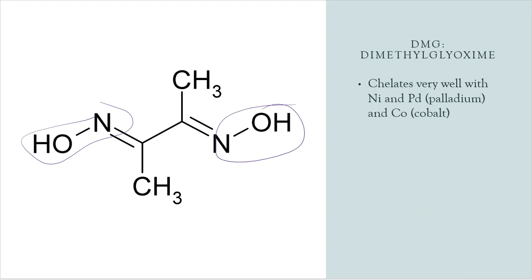The issue here, though, it's not a one-to-one. We've seen this quite a bit in the laboratory. You might not have realized it, but it's been a one-to-one pretty much, except for here. It actually takes 2 of these to tango. So 2 of these are going to be required to bond to nickel and precipitate it out of solution.